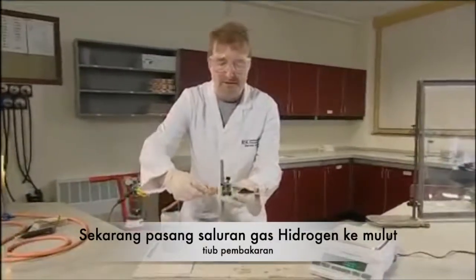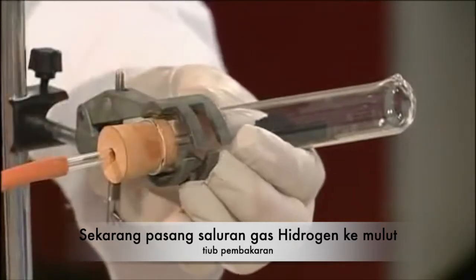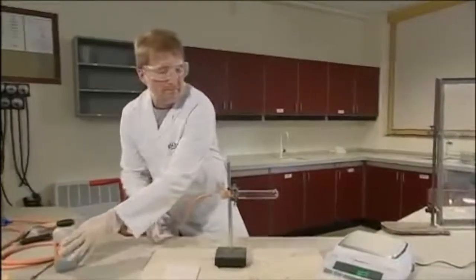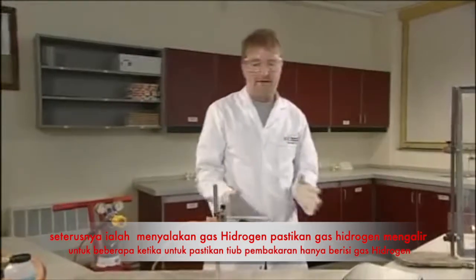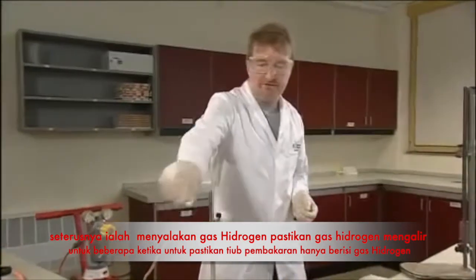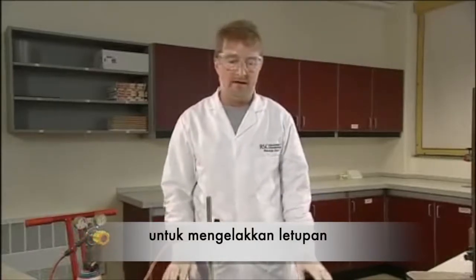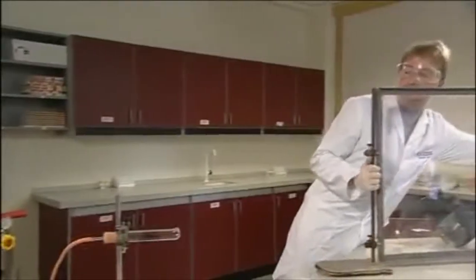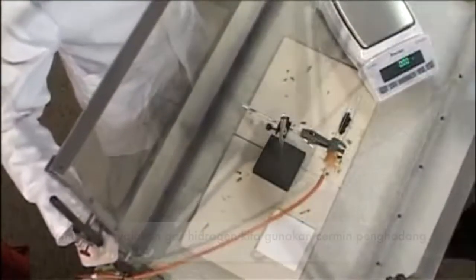Now place the hydrogen delivery tube in the end of the reduction tube. The next step is to light the hydrogen, but it's important to wait for about a minute to make sure all the hydrogen has flushed out any air from the reduction tube, otherwise you could get an explosive mixture in there. For the lighting process, we have safety screens to protect the demonstrator and the audience.